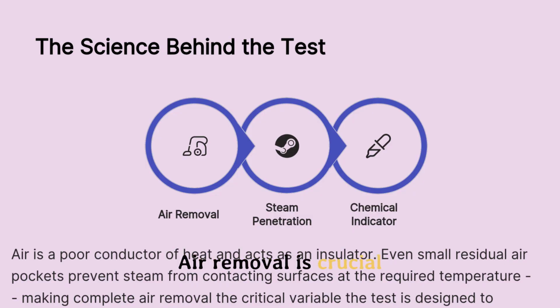Air removal is crucial in steam sterilization. Air acts as an insulator, hindering heat transfer. The Bowie Dick Test ensures complete air removal, allowing steam to contact surfaces at the necessary temperature. This process is vital for effective sterilization, as even small air pockets can compromise the procedure.